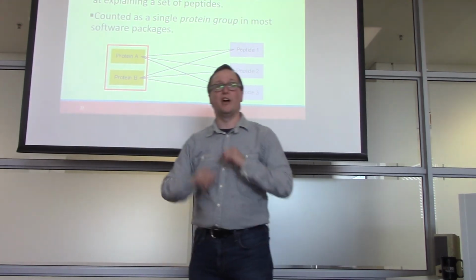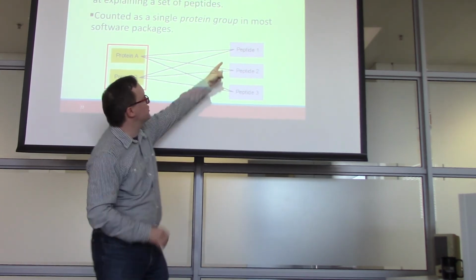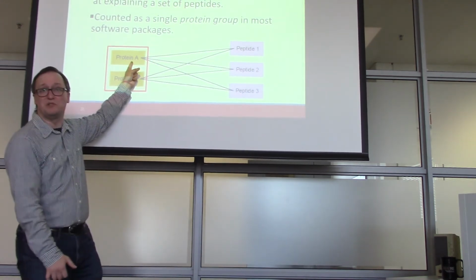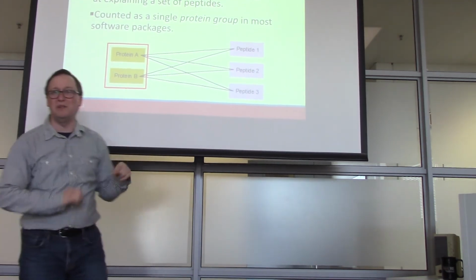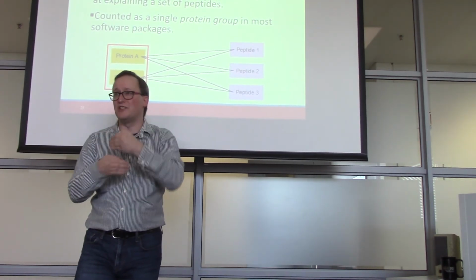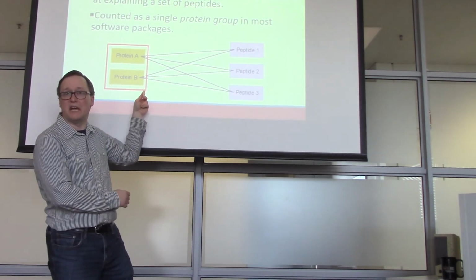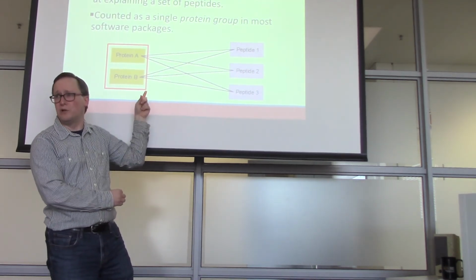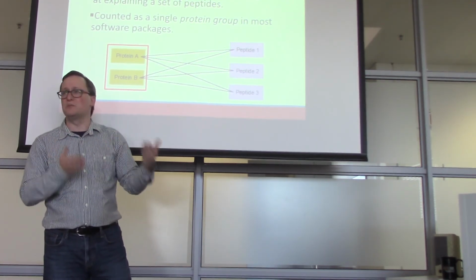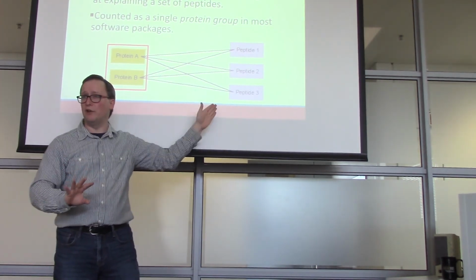We have a large number of equivalent proteins. And we say that they're equivalent because you may have situations where this set of peptides could be explained by the presence of protein A or the presence of protein B, and neither one of them is an advantage in explaining the data. So in our software, we typically say these count as one protein, and either accession would be equally good in making the explanation of why these peptides were present. Does everyone see that from the graph here?